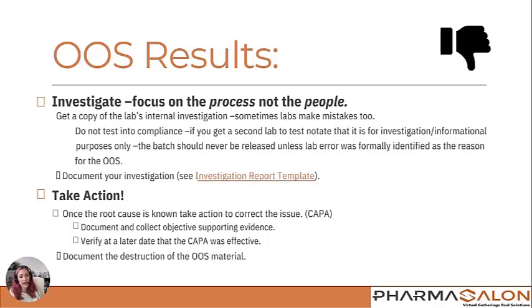So you can't really have a testing program without an investigation procedure that goes along with it, because no matter how good you are, something at some point is going to come back out of specification, and it is very important for you to understand how to address that, how to investigate it and correct it, and make sure all of your documentation is thoroughly completed.